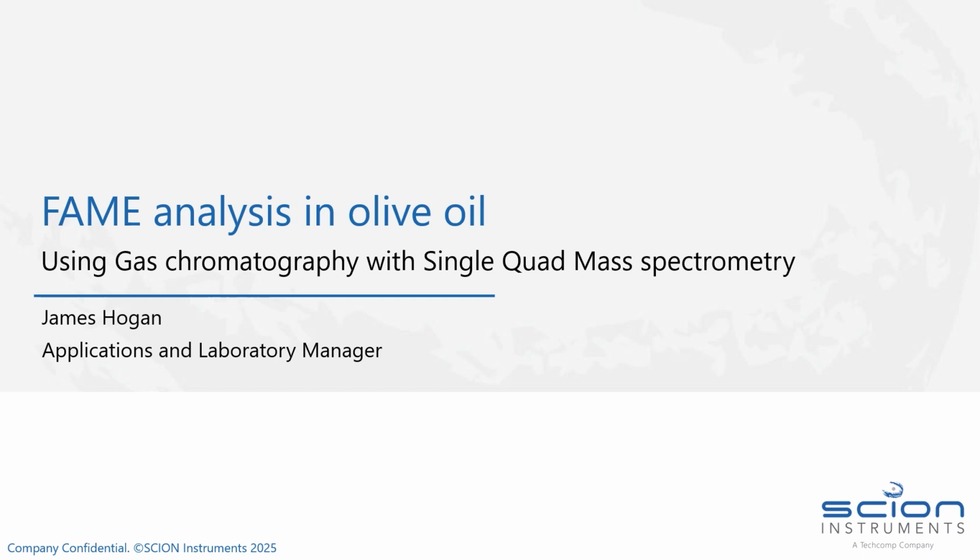Today's topic will be FAME, or Fatty Acid Methyl Ester, analysis in olive oil using gas chromatography mass spec. We'll focus on what FAMEs are, why we test for them, including some of the regulations surrounding it, and how we test for FAMEs, so some of the crucial instrument parameters on the GC and the MS that are needed for successful testing.